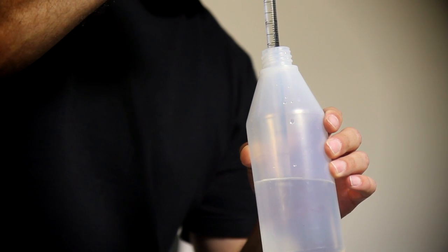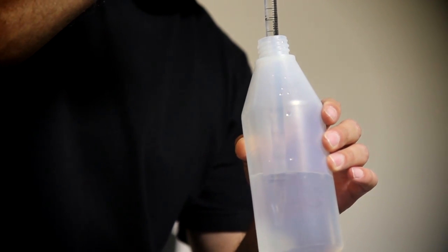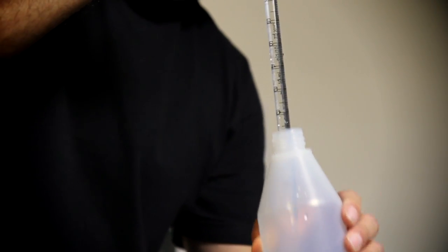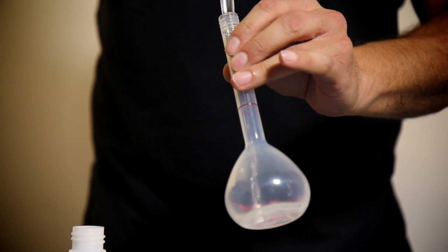To begin, measure 10 ml of the 10,000 ppm standard using the pipette. Dispense the pipette contents into the 100 ml flask.